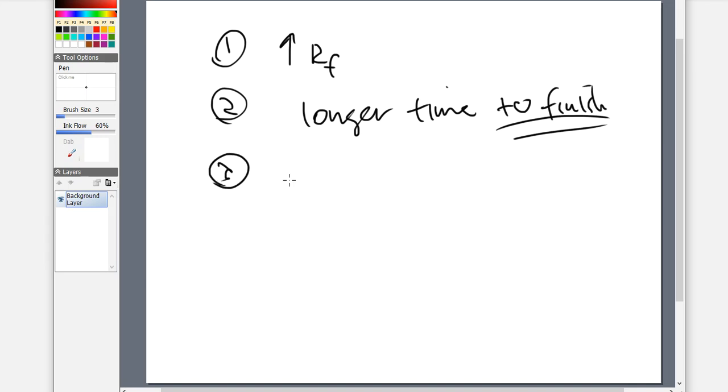Number 3, we actually have changes that can happen here a little bit easier, and those changes are going to be majorly impacted by the change in temperature and by the change of humidity. This is not controlled. That chamber is not controlled. That chamber has not been placed a lid on. We're not doing anything with our humidity levels at all. It's just like, pour it in and put the plate in. Now put the lid on and go. I mean, that's what this is.